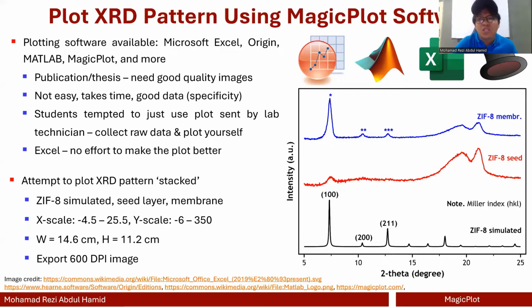I saw students also use Excel. There's nothing wrong with it, but what they did was they just select the data that they want, and then go to plot, scatter, line, or whatever, and that's it. Just change the X-axis label and the Y-axis label, and be done with it. They don't really take the effort to make the figure nicer.